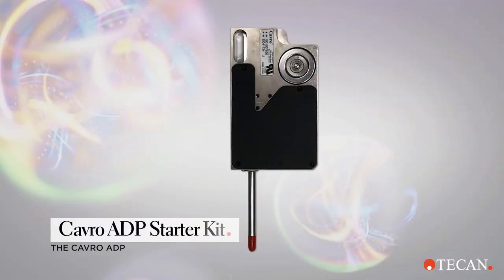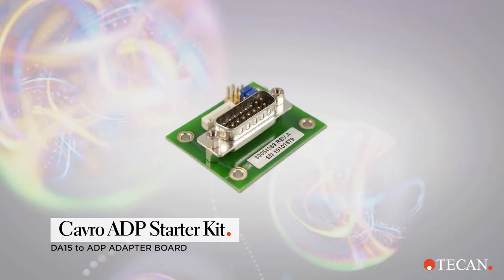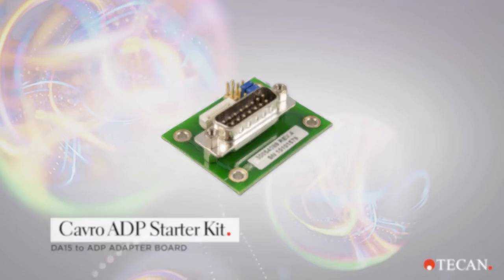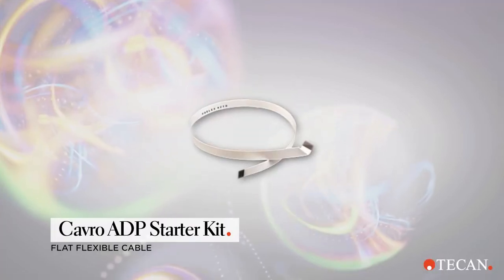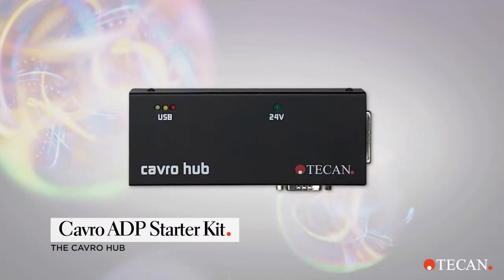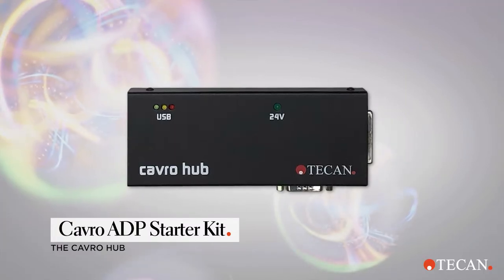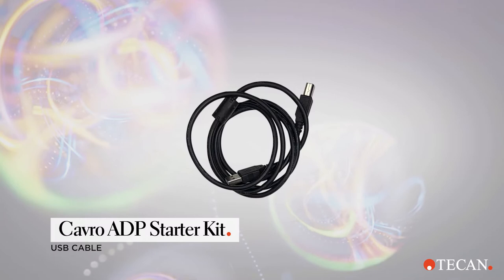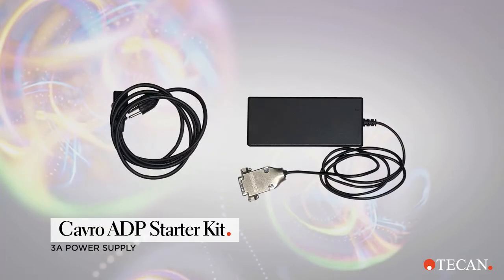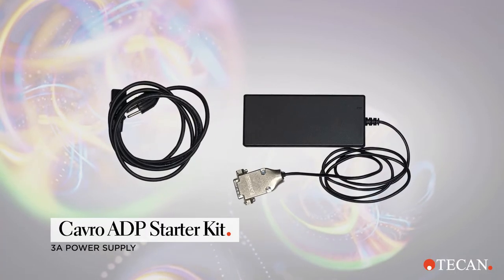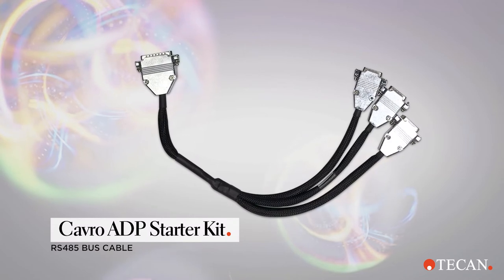These include a fully configured CAVRO ADP, a DA15 to ADP adapter board, a flat flexible cable kit with strain relief clamp, and your CAVRO integration kit, which includes the CAVRO Hub, USB cable, a 3-amp power supply, and an RS-485 bus cable.